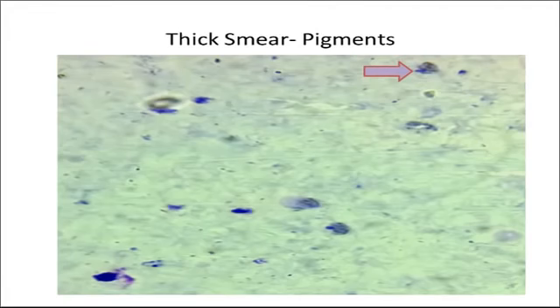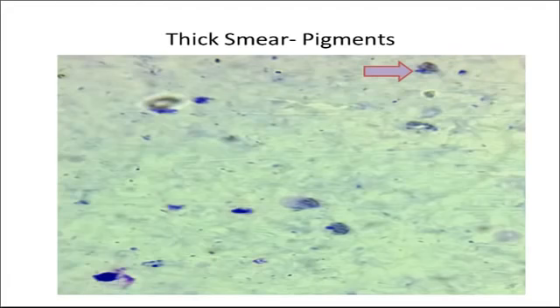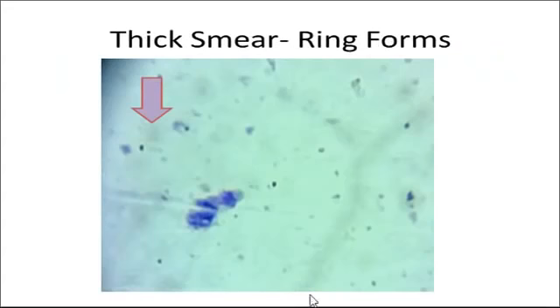In this slide, you can see a brownish pigment — that is the malarial pigment, also known as hemozoin. It is a pigment produced due to the destruction and digestion of RBC products by the malarial parasite. We also see ring forms, identified by the chromatin dot.